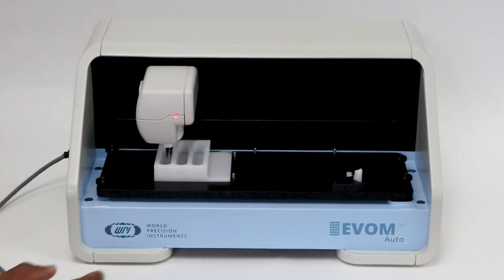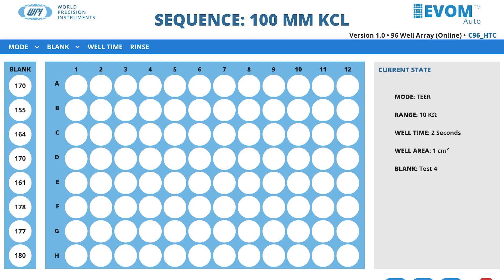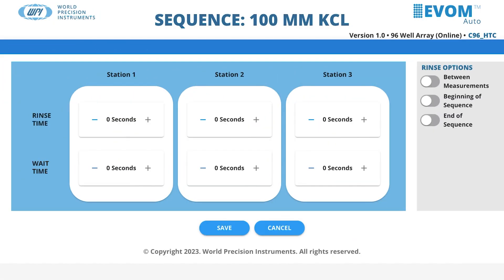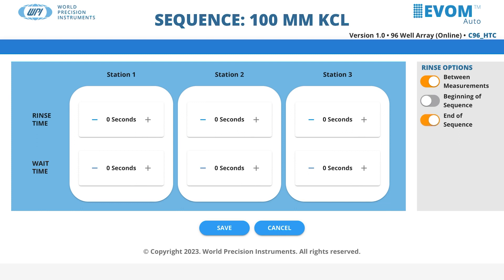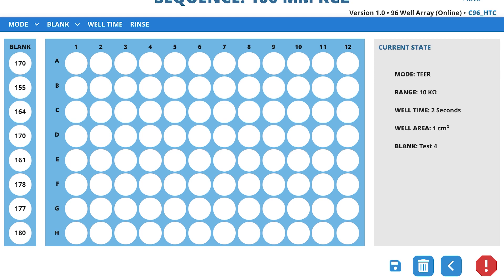The three rinse stations may be used for rinsing, disinfecting, stabilizing, or any other function desired. Configure the rinse schedule by selecting Rinse from the menu. You may set the rinse time and the wait time in each rinse station using the toggle controls on each field. Three toggle buttons in the rinse option section on the right side of the window let you set when the rinse and wait parameters are implemented. You may choose any combination of these options. After the schedule is set in the rinse time window, press save to save the changes and then return to the sequence window. Now that we have defined the sequence, we can use it in a plate. Press the back button to return to the main window.